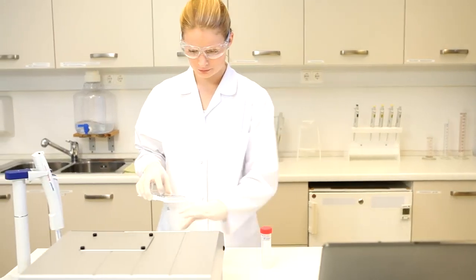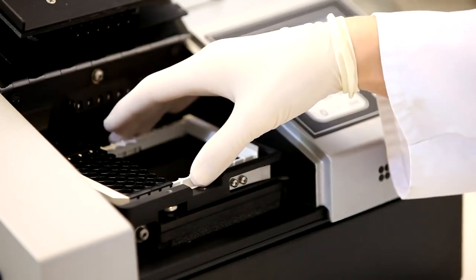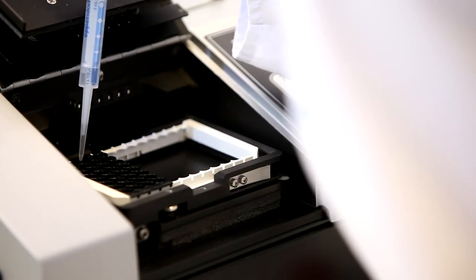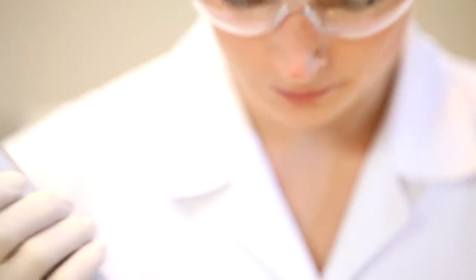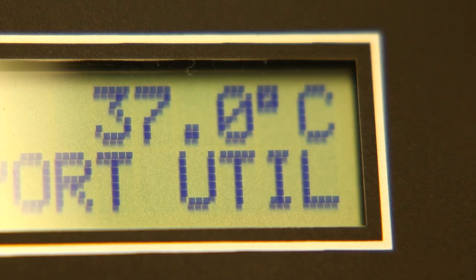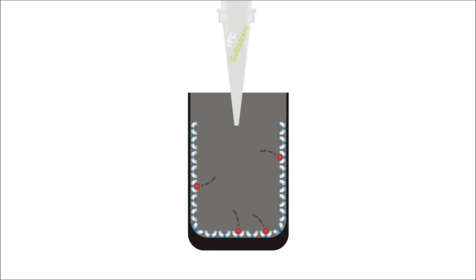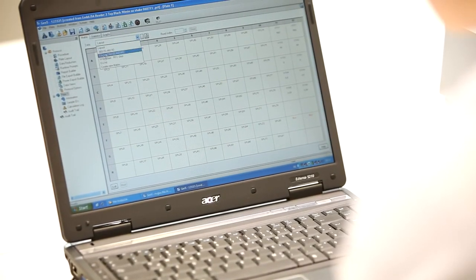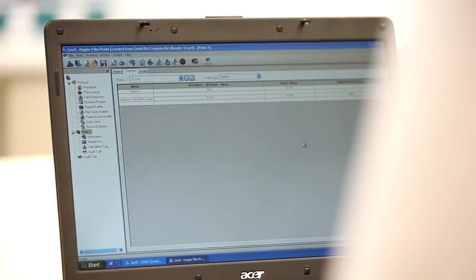Place the Endolysa plate close to or directly in the fluorescent microplate reader. Add 100 microliters of assay reagent to each well. Close the reader and wait one minute in order to allow the temperature to adjust to 37 degrees Celsius. Any endotoxin will activate the zymogen form of recombinant factor C, which finally generates a fluorescent signal by the conversion of a substrate. Make the first fluorescent signal reading at time point zero and incubate the plate at 37 degrees for 90 minutes. Then make the second, end point fluorescent signal reading.